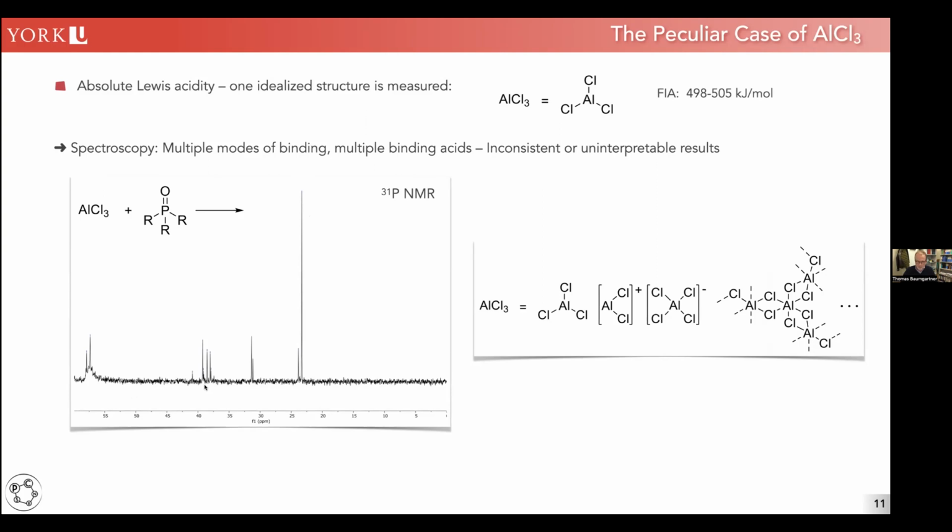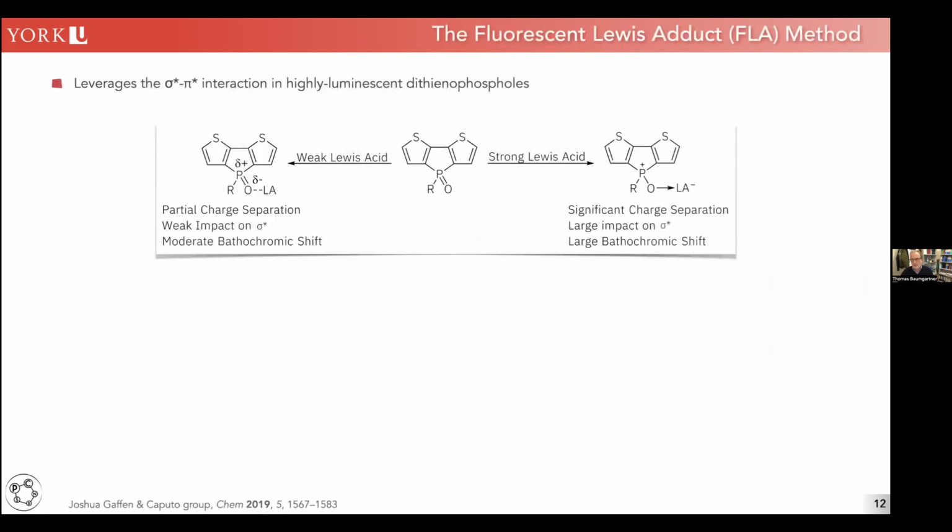So if you want to pinpoint the absolute Lewis acidity of aluminum trichloride, the Gutmann-Beckett method fails miserably because there are different species in solution, and here's just a selection of them that can occur. You may have some monomers in there, you may have these ion-separated pairs, you may have clusters of it, dimers, trimers, and you name it. They all can interact with the phosphine oxide here, and that gives you a selection of molecules. So there's a problem when you refer to absolute Lewis acidity, because you do not always have a single species in solution. We really want to make sure that we incorporate all these things in one measurement. And this is what our method does.